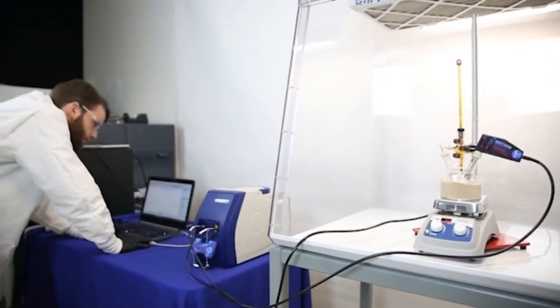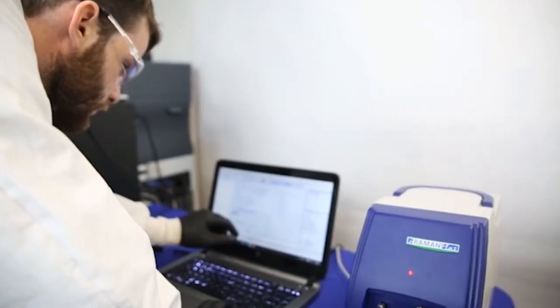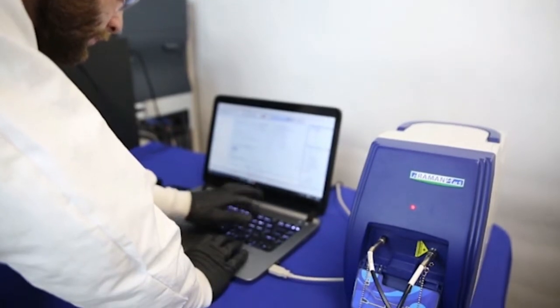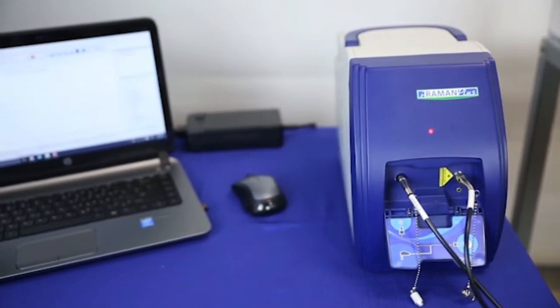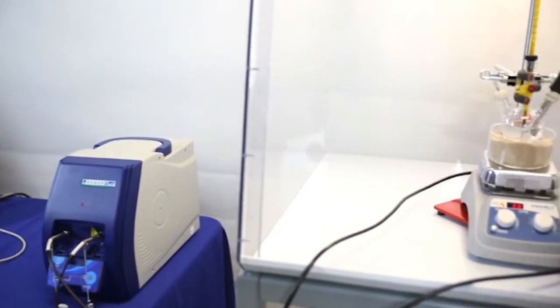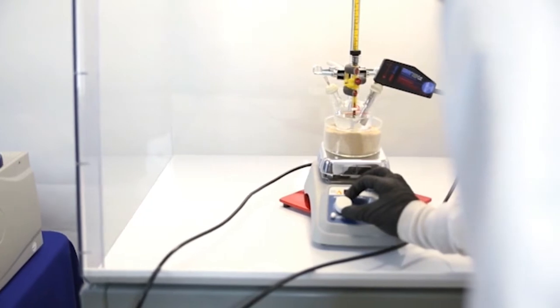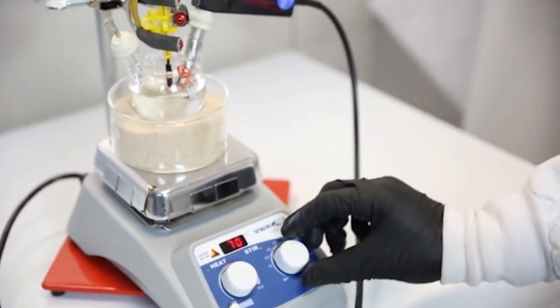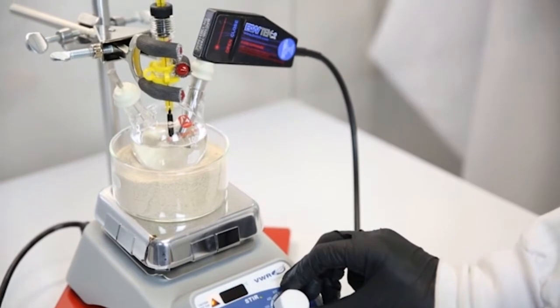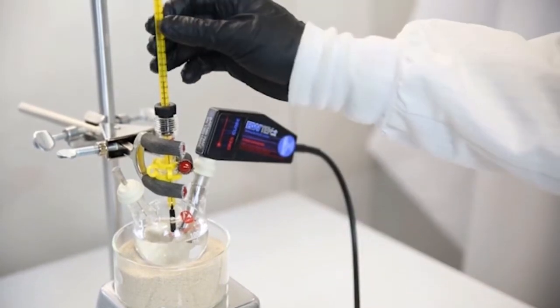The i-Raman Plus is a portable, compact, and lightweight Raman system equipped with a TE-cooled back-thinned CCD detector, allowing for high sensitivity. The laser utilizes our patented CleanLaze technology, enabling extremely narrow bandwidth and high power output of around 300 milliwatts at an affordable price. The unique optical design provides spectral resolution of around 3.5 wavenumbers across a spectral range of 65 to 3200 wavenumbers. The system comes standard with a fiber optic probe for flexibility at the sampling interface and the ability to couple with other accessories.